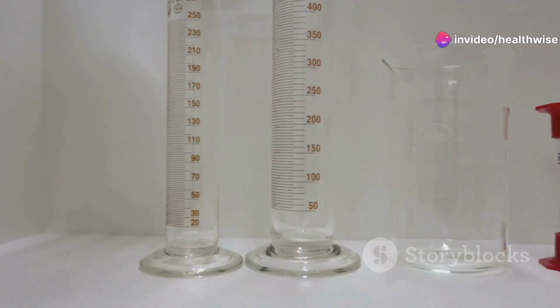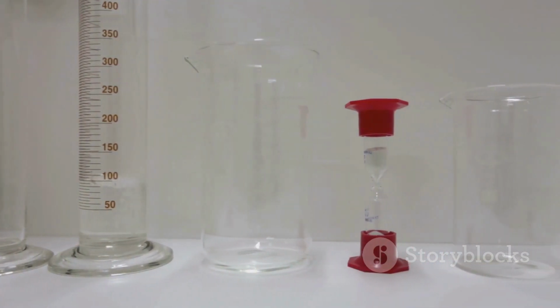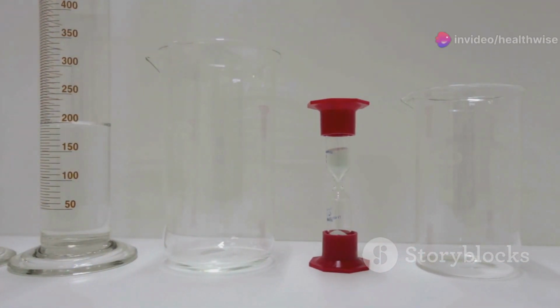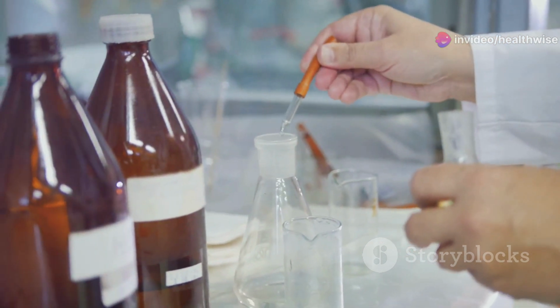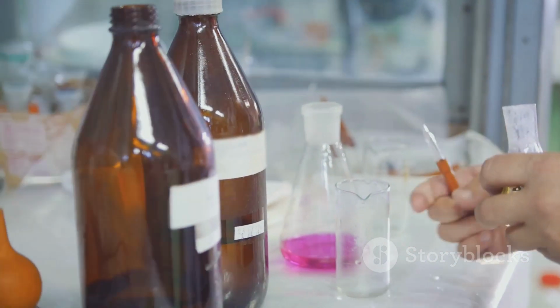Tube 3, 180 mg/dl glucose, 0.5 milliliters stock standard, 0.5 milliliters isotonic sodium chloride solution. Tube 4, 270 mg/dl glucose, 0.75 milliliters stock standard, 0.25 milliliters isotonic sodium chloride solution. Tube 5, 360 mg/dl glucose, 1.0 milliliters stock standard, 0 milliliters isotonic sodium chloride solution.